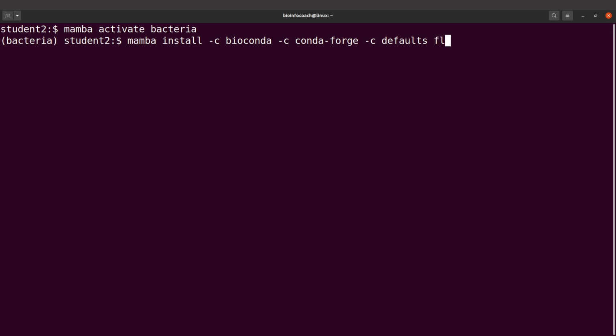So I'll use Flye, this will be used for genome assembly. Filtlong will be used for filtering the reads. We will also use Bandage to visualize the assembly. We will use QUAST to evaluate the genome assembly. We will use NanoPlot. All right, like this. Let me just redo it here. So from Bandage, I will say NanoPlot.